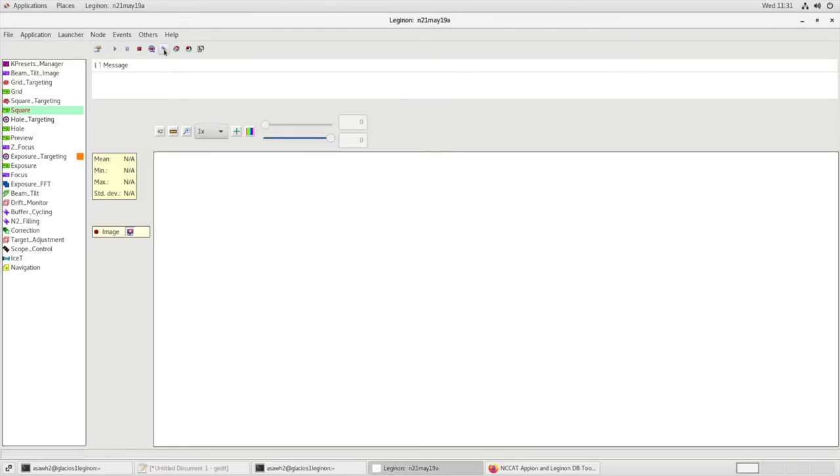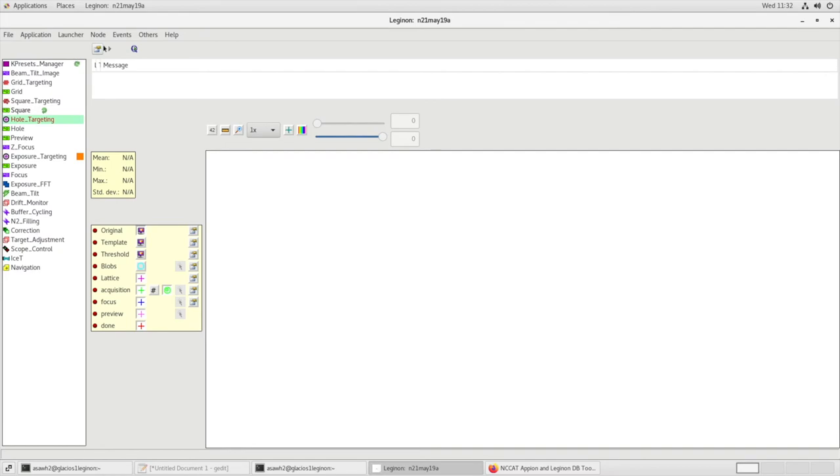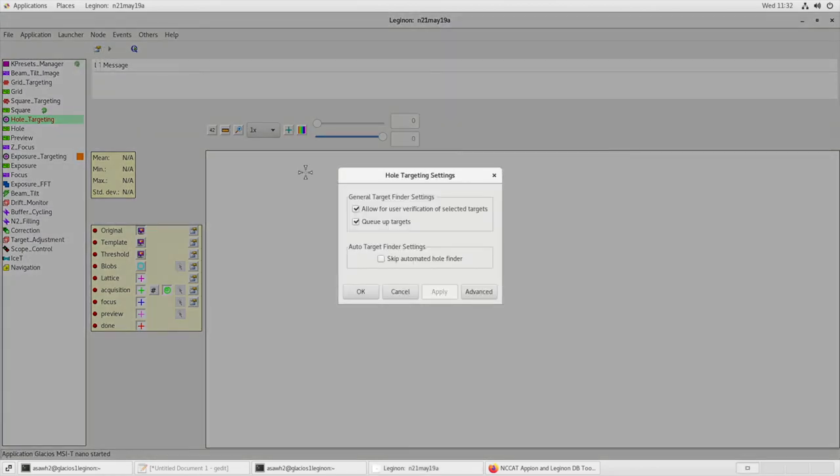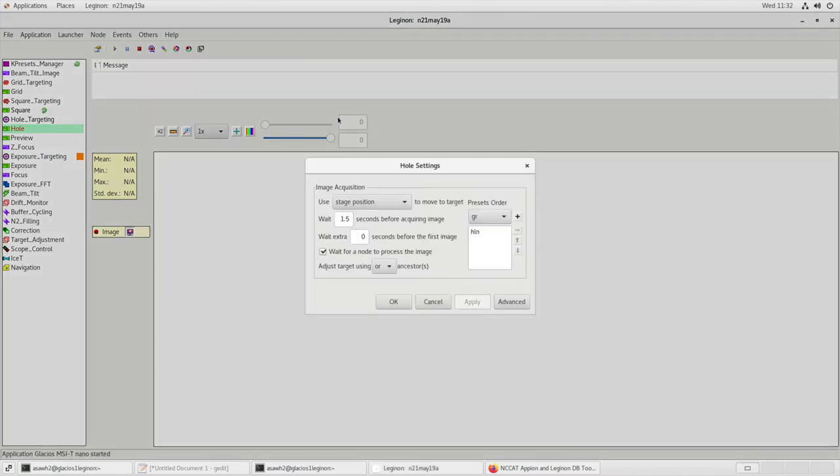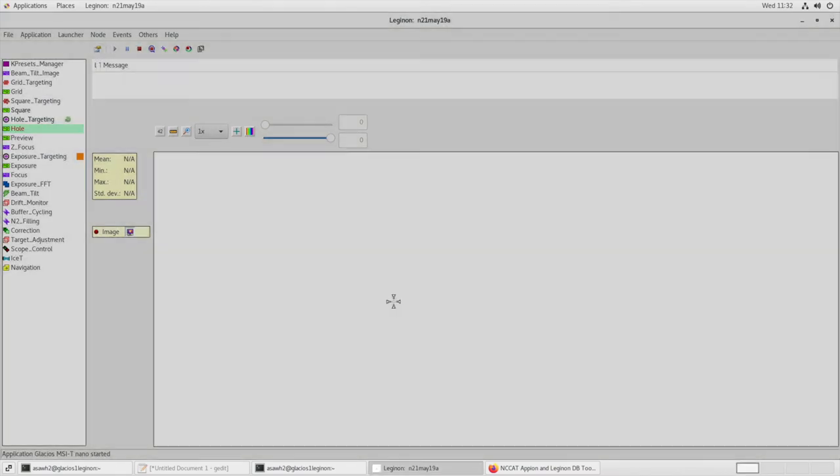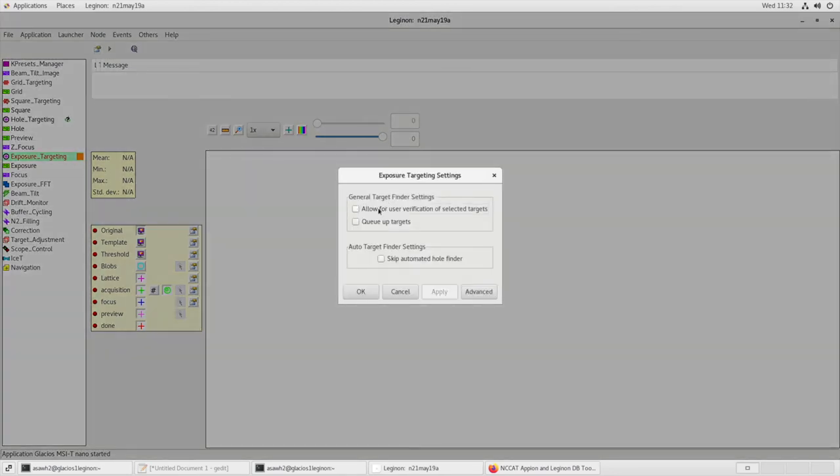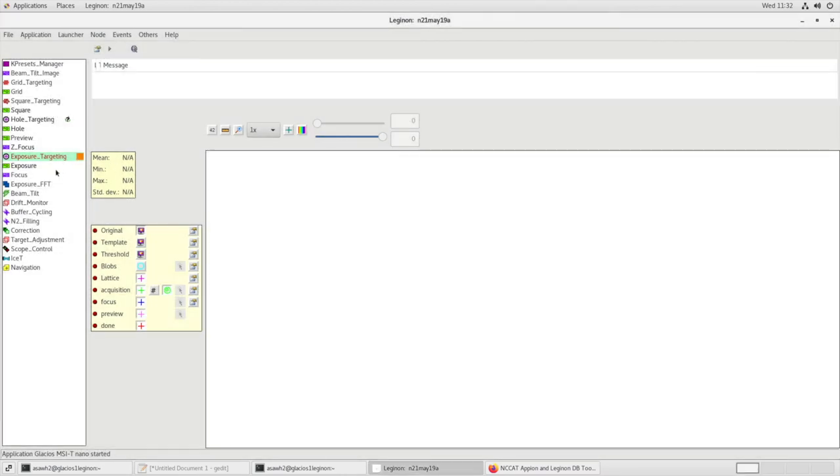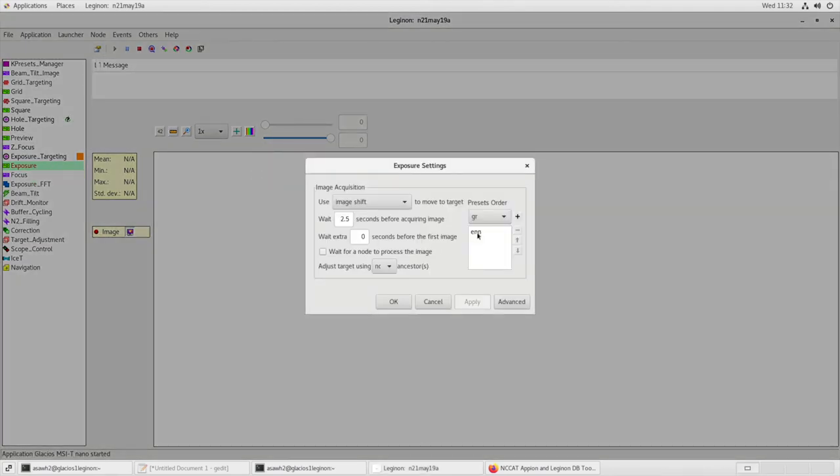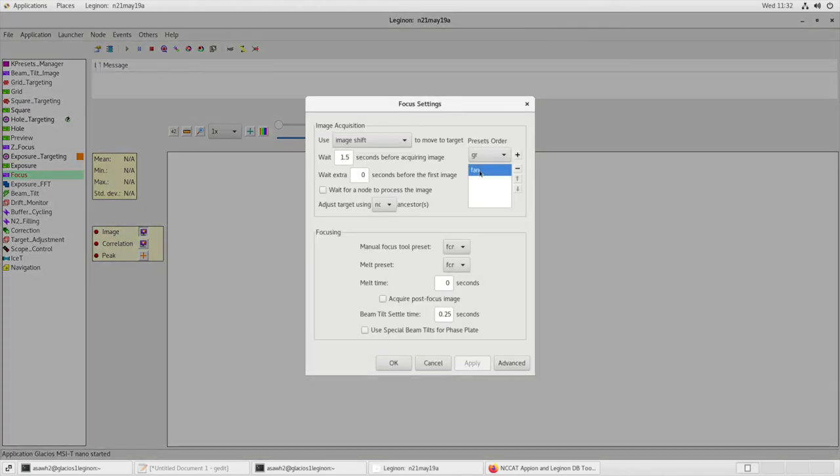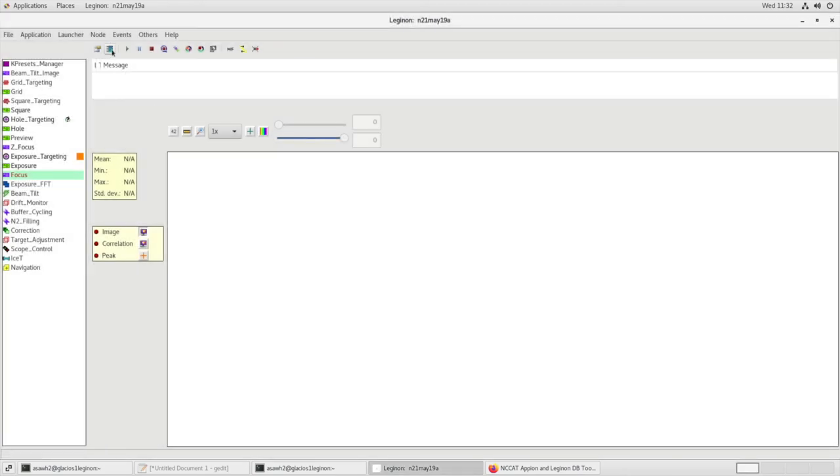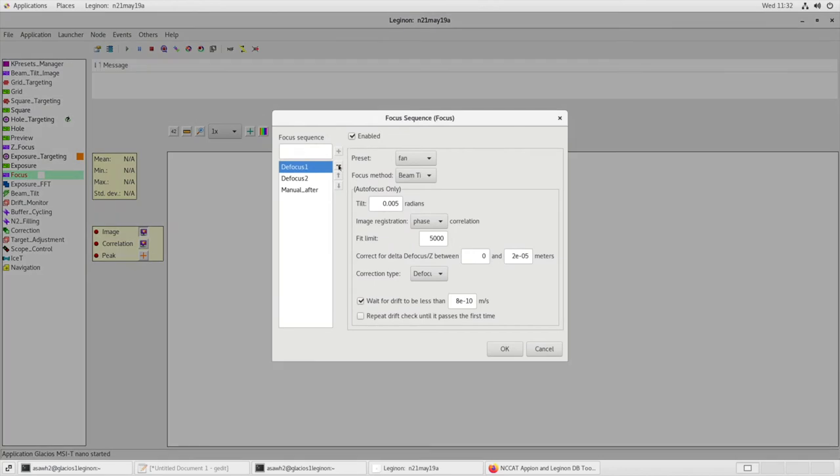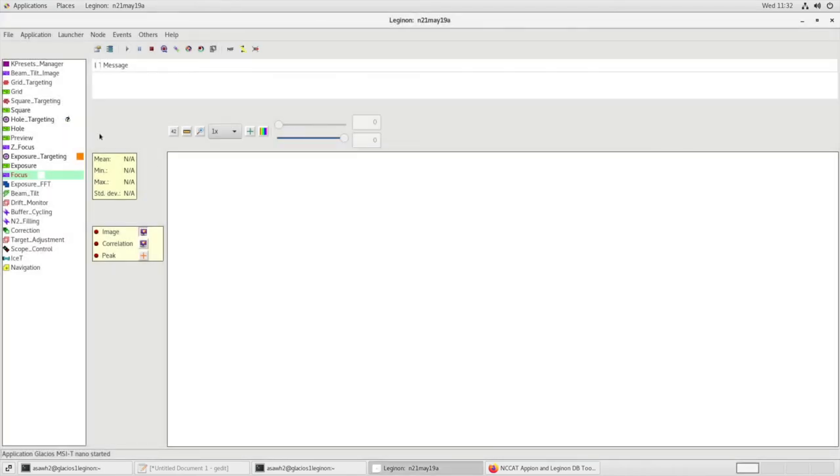In Square Node, let's simulate a target. Let's go to Hole Targeting Node Settings. Make sure that Allow for User Verification is selected targets, and Queue of Targets is checked. In Hole Settings, we want to make sure the Preset Order is HLN. In Exposure Targeting Settings, we want to make sure Allow for User Verification is selected. Okay. Exposure, we want our Preset Order to say ENN. In Focus Node Settings, we want our Preset Order to say FAN, our Manual Focus to be FCN, our Melt Preset to be FCN. In Focus Sequence Settings, Defocus 1, the Preset should be FAN, Defocus 2 FAN, and Manual Focus After is FCN. Okay.